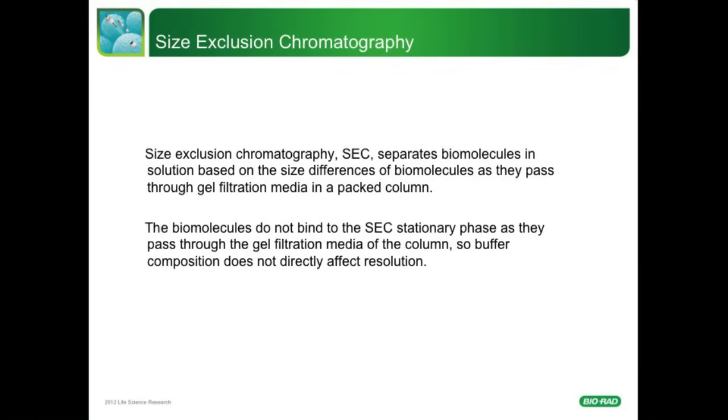So what is size exclusion chromatography, or SEC? What's the definition of size exclusion chromatography? Size exclusion chromatography, SEC, separates biomolecules in solution based on the size differences of biomolecules as they pass through gel filtration media in a packed bed. The biomolecules do not bind to the SEC stationary phase as they pass through the gel filtration media of the column, so buffer composition does not directly affect the resolution.